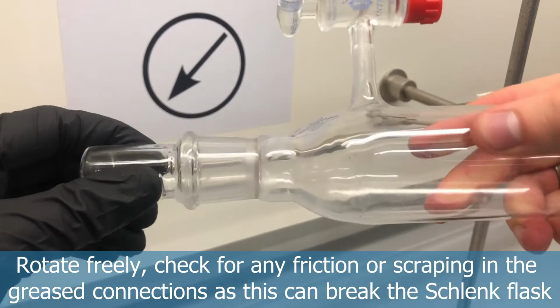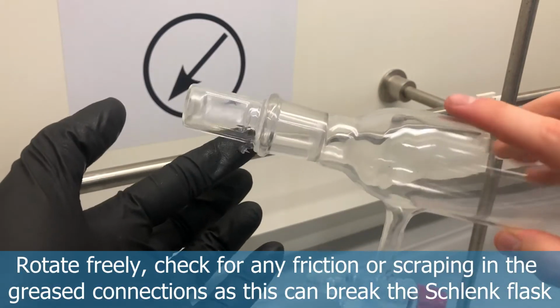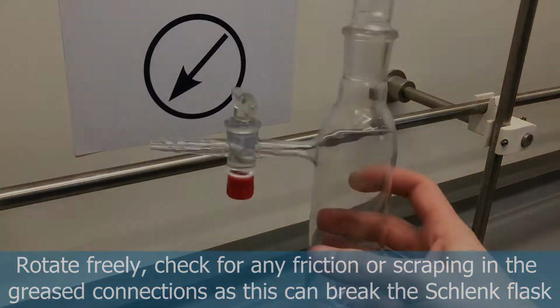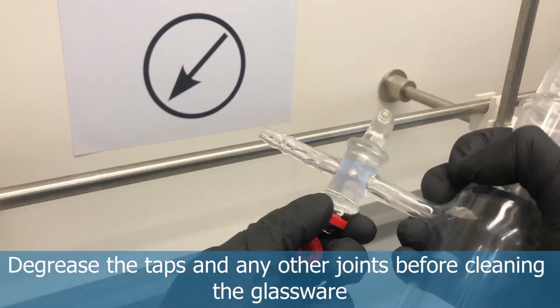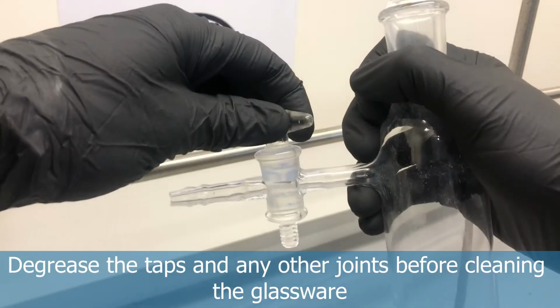because again, any solid material caught in the grease is going to affect how tightly sealed it is. Any friction in there as well can damage and score the glassware, which we don't want. If we ever feel that these joints are seizing up throughout the day, we need to immediately re-grease, as any friction with the glassware can cause it to break and of course affect our reaction.